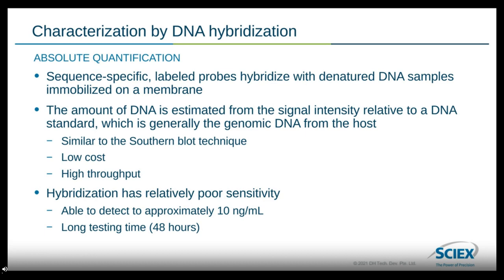So like PicoGreen though, one of the major drawbacks is another lack of sensitivity, usually right about 10 nanograms per mL. It also has a pretty long testing time, upwards of 2 days. And that's really why we've steered away from this method in more recent years.